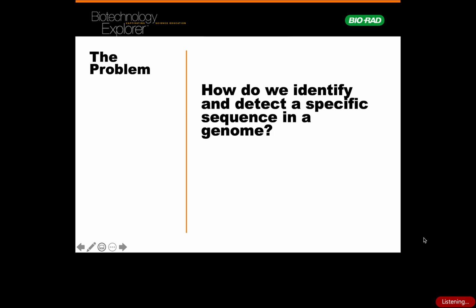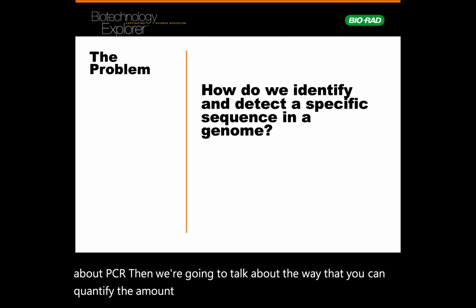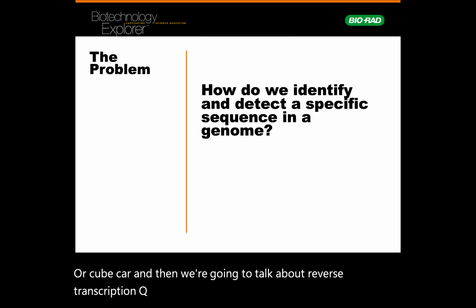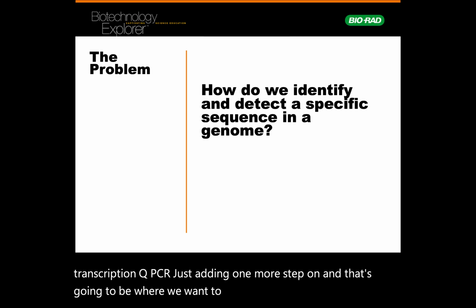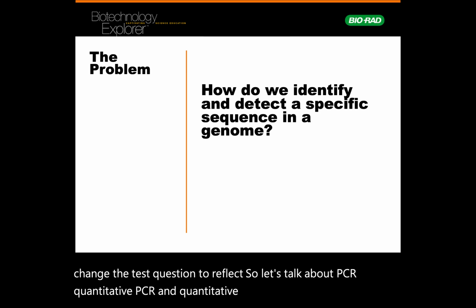Hello. I've got a three-parter for you today. We're going to talk about PCR, then we're going to talk about the way that you can quantify the amount of PCR products. It's called quantitative PCR or qPCR. And then we're going to talk about reverse transcription qPCR, just adding one more step on. And that's where we want to end up, and that's what I'm going to change the test question to reflect. So let's talk about PCR, quantitative PCR, and quantitative reverse transcriptase PCR.